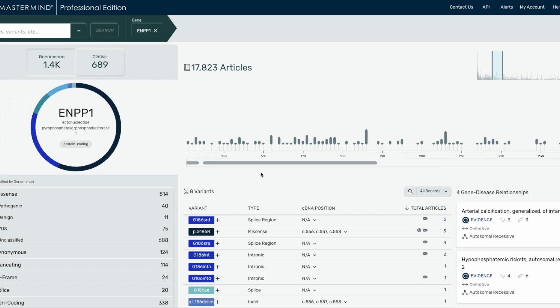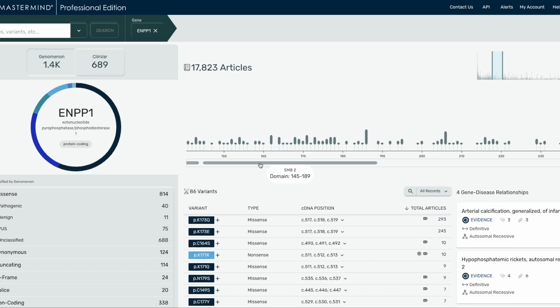Below the x-axis, you'll notice these horizontal bars which represent critical protein domains of the gene you are investigating. Hovering your cursor over the protein domains will show the name and amino acid range of that domain. You can also click on a gray bar which will filter the variants in the list below to show all variants at that specific domain.